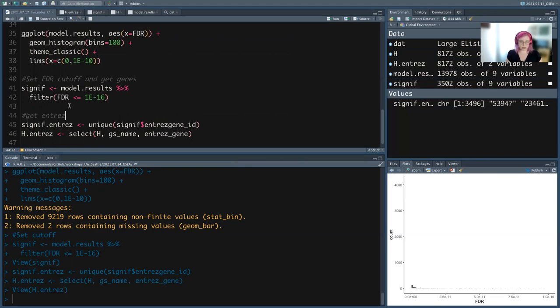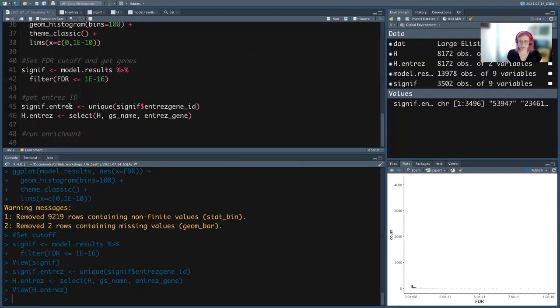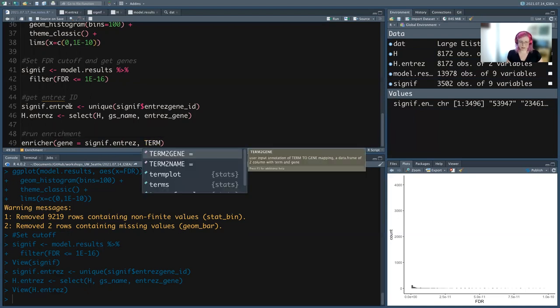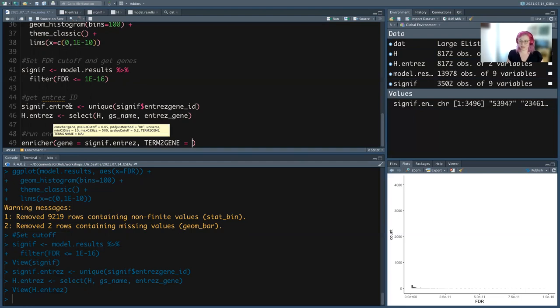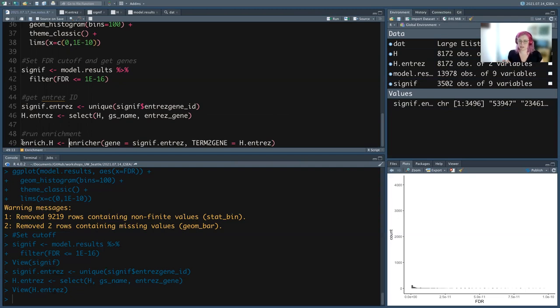To run enrichment, the function is just enricher(). You give it your genes — our significant Entrez IDs — and then TERM2GENE, which is your gene set term and what genes are in it. We'll save this as something like 'enrich_H' for Hallmark enrichment, since we're going to be running C2 and other things too — it's always good to label these so you know it was Hallmark. It outputs a complex S4 object, not a nice data frame, so we'll go into how to pull stuff out of it.